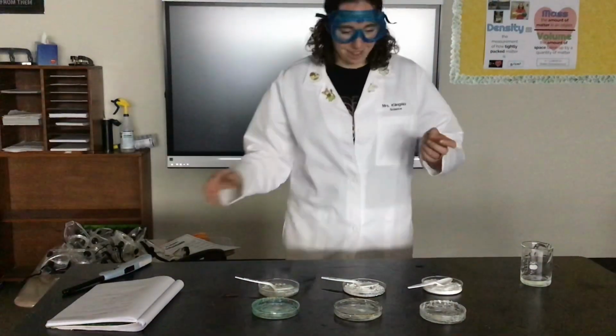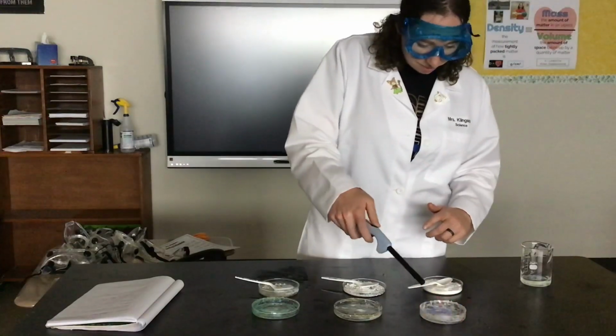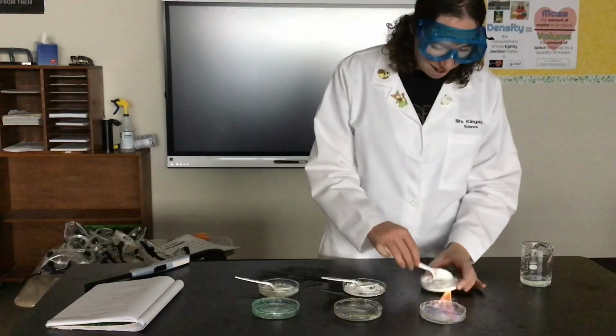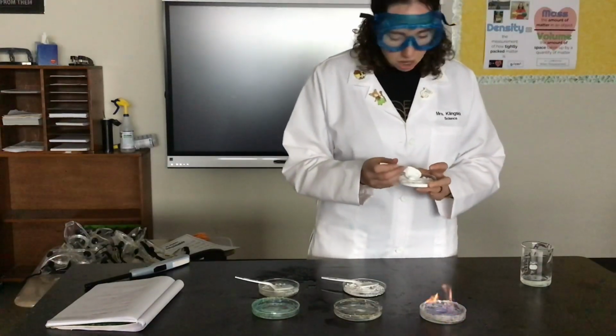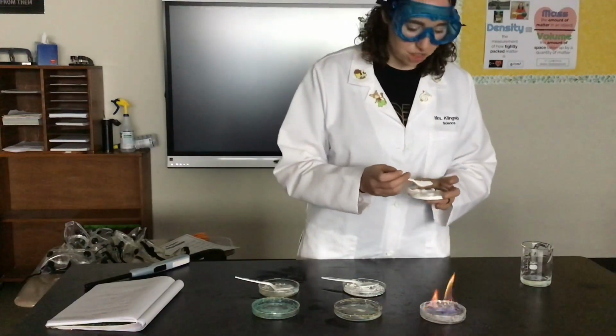All right. Okay, so we're going to do the borax first. That's this one. As you can see, my ethyl alcohol is flammable, and so it is lit on fire right now. And what I'm going to do is sprinkle in some borax. First, notice what color it is. Okay, and let's see if that color changes.